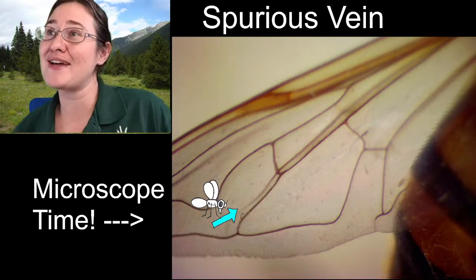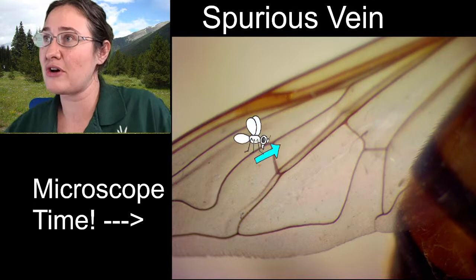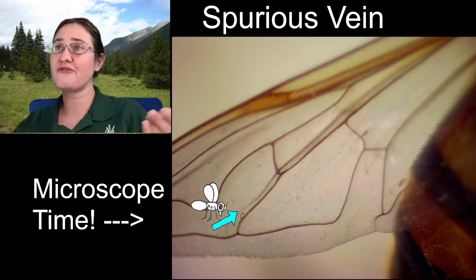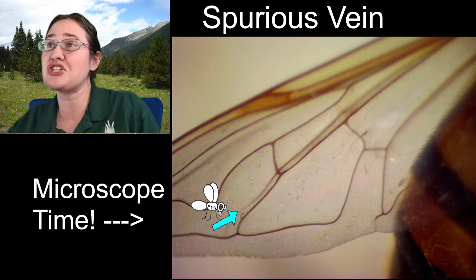No other flies have a vein like this that just disappears, all right? This is the spurious vein. And if a fly has a spurious vein, it is a flower fly. There are all different colors, all different shapes of flower flies. All you need to do is look at the wing.